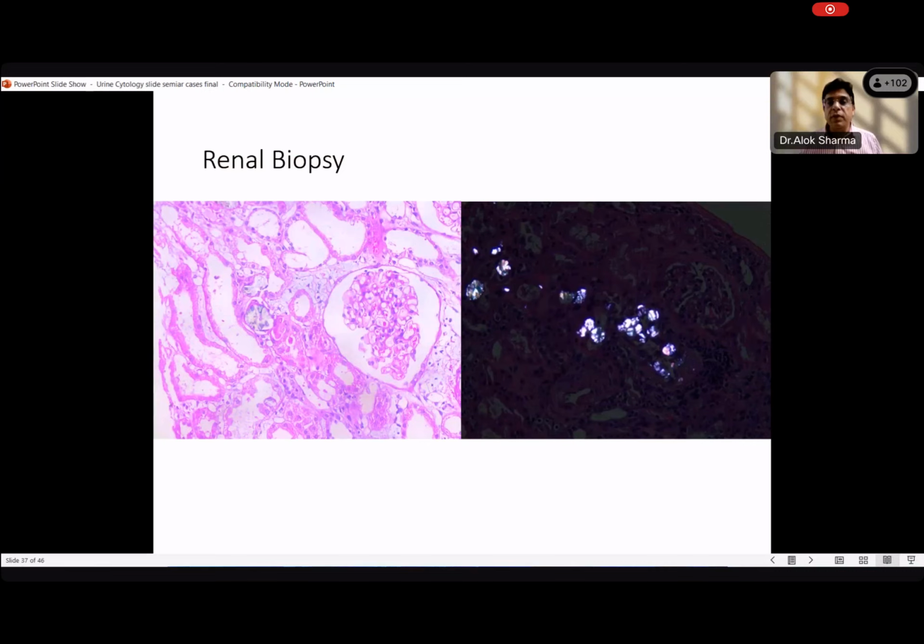So somebody can explain this biopsy. Akshay, maybe you can. Yes, sir. Quickly, just tell us what do you see in this. Firstly, I would like to comment on the glomeruli. Glomeruli are shrunken. Anything else just next to the glomerulus on the left side? There are crystals. What is on the right side? These crystals are seen bluish in color, and it is seen in polarized light. This shining calcium oxalate crystals. Can you give a scientific term for this shining?